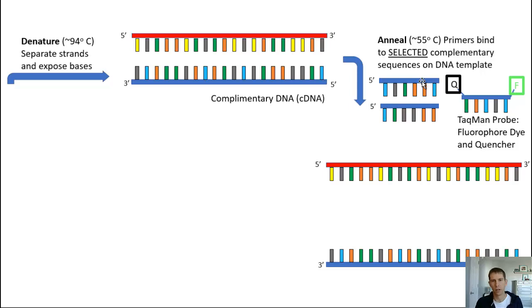Now, this may take a little bit of research on the side to get a better idea, but for the COVID-19 virus, there are actually 30,000 base pairs in the RNA strand. So for our primers, we need to be very selective and make sure that our primers are only going to interact with the specific base pair region of RNA or complementary DNA that we want to focus on that is specific to our COVID-19 virus that we want to test for.